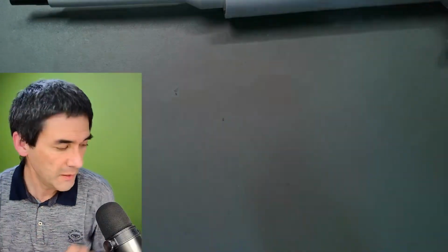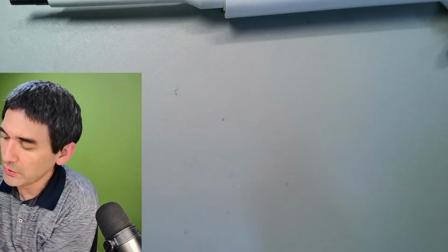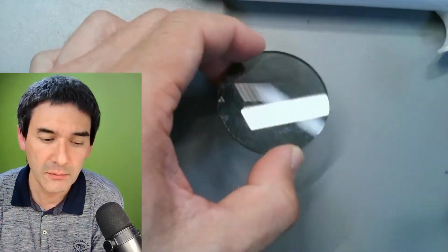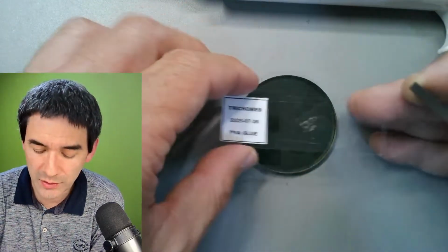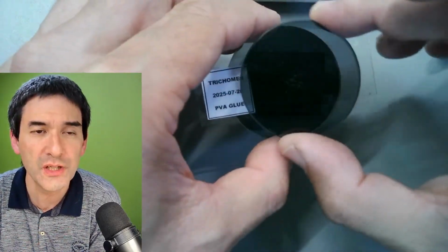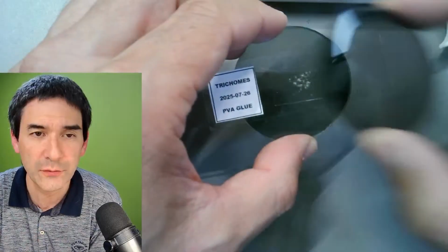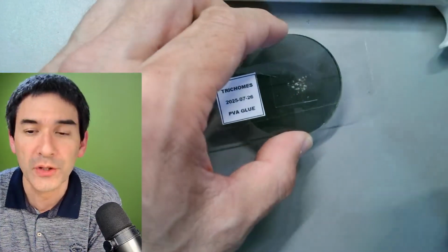If you're also interested in doing polarization work, all you do is put a glass filter here, but you can also buy a polarization film, one on the bottom, one on the top, and you put it into crossed position. Right now there is no light from the bottom, but then you can see them shine up on a dark background.